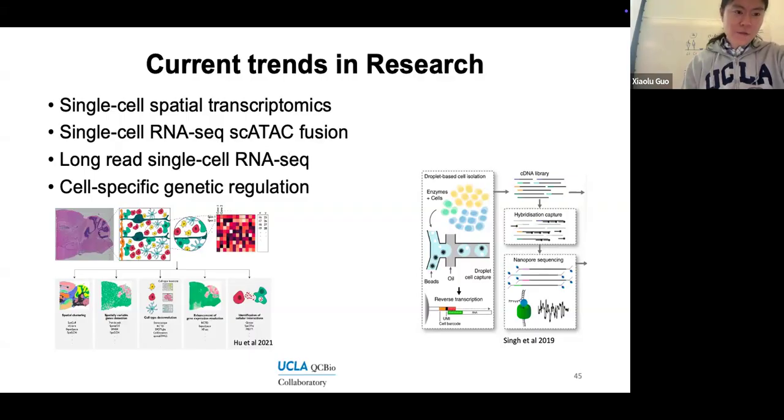What we have discussed, if you remember, when we discussed the length of the mRNA, is that it's only 98 bases for the sequencing. 16 bases are barcode, 10 bases are for the UMI, and the mRNA part is only 90, less than 100 bases.